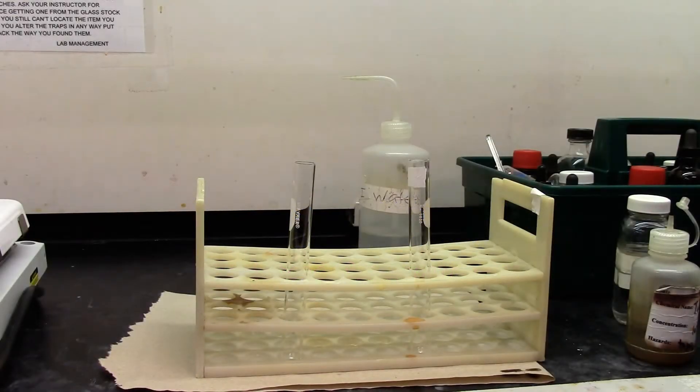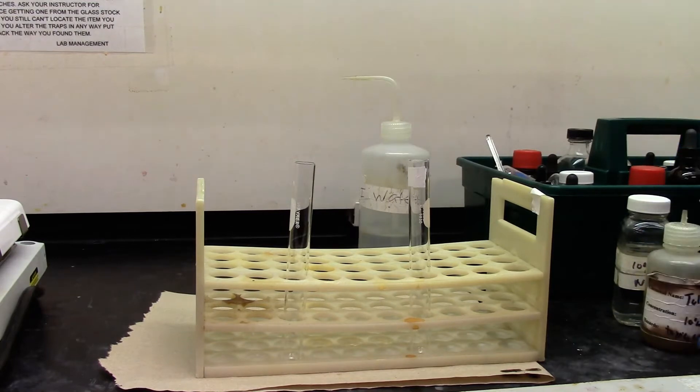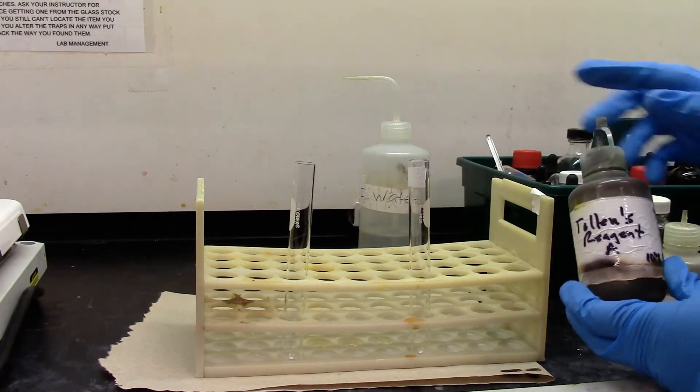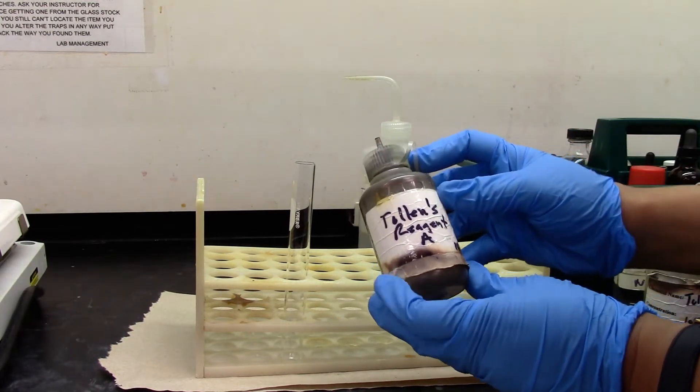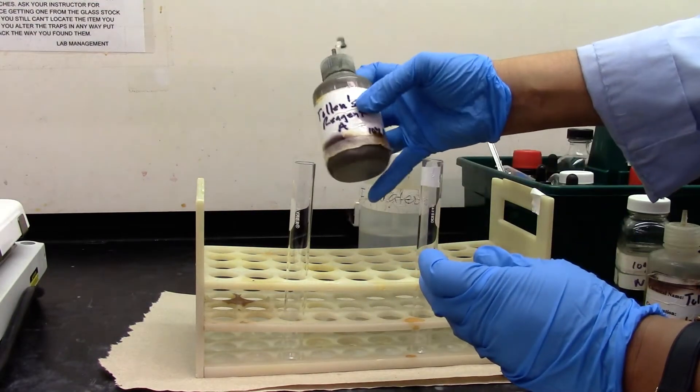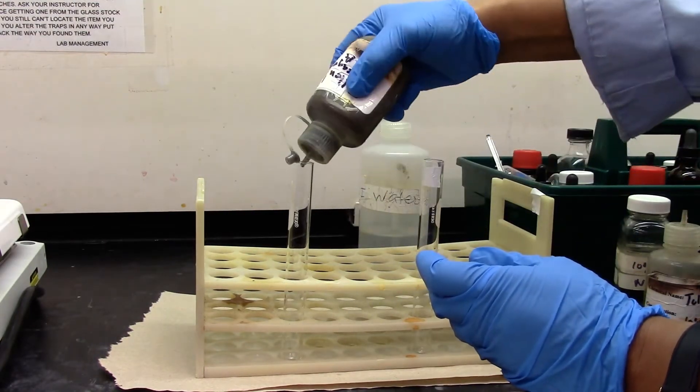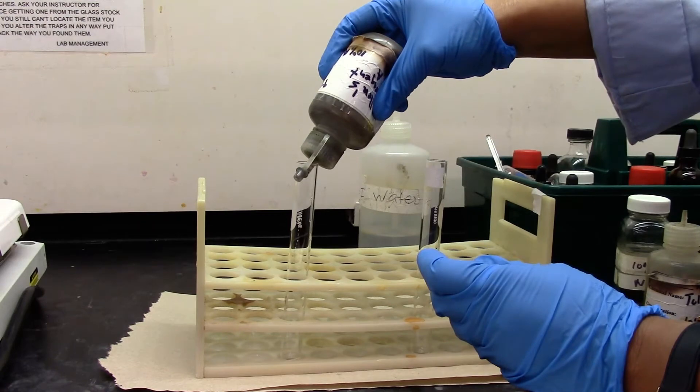We are going to try Tollen's test for aldehyde. First we got to make the Tollen's reagent. I am adding about a milliliter of Tollen's reagent A, that is 10% silver nitrate.